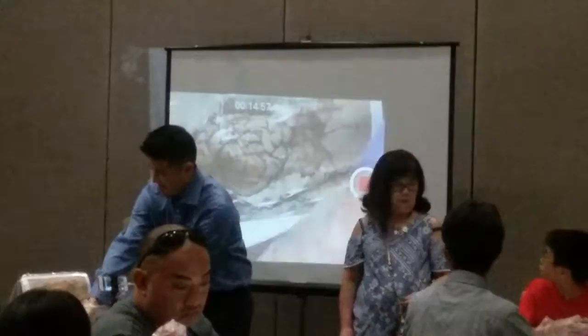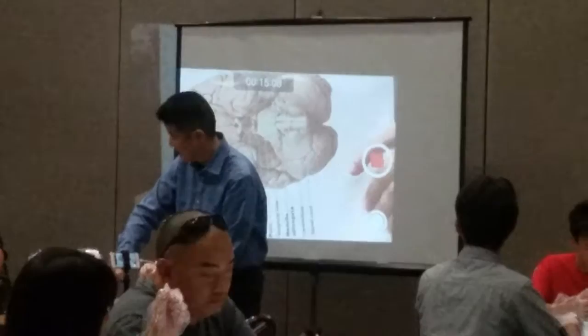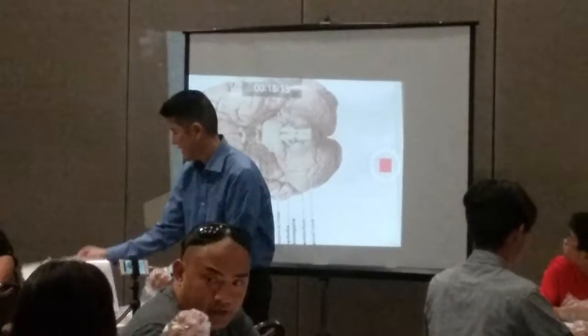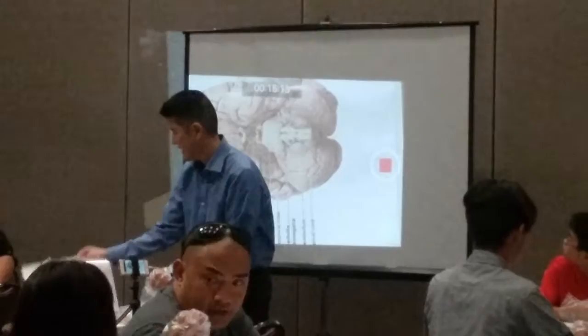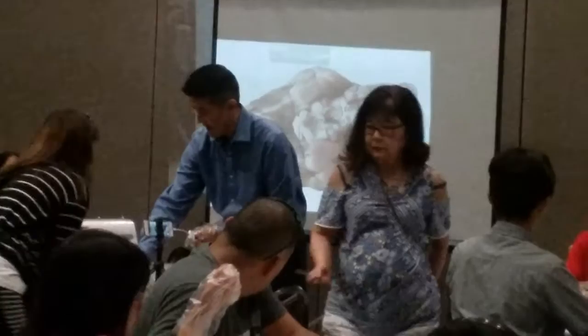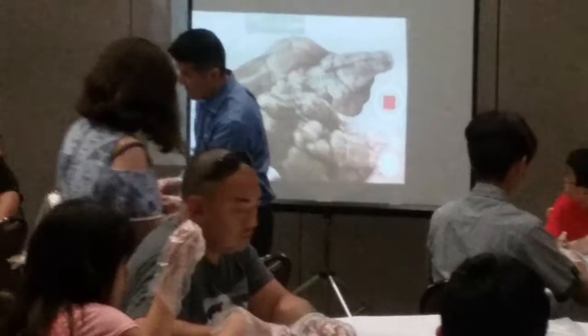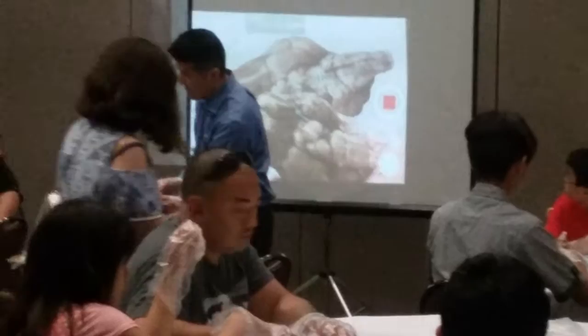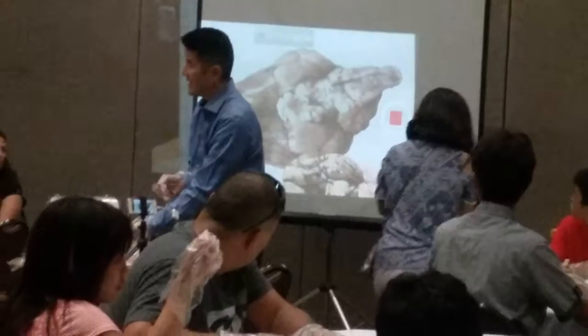I'm going to turn over and have a look at the ventral surface of the brain. This is the ventral view of the human brain. In the sheep brain, one part that's much bigger than in the human is the olfactory bulb — see this white thing here. The olfactory bulbs control our sense of smell and our sense of taste. If you get a brain injury and damage your olfactory bulbs, you can't smell.